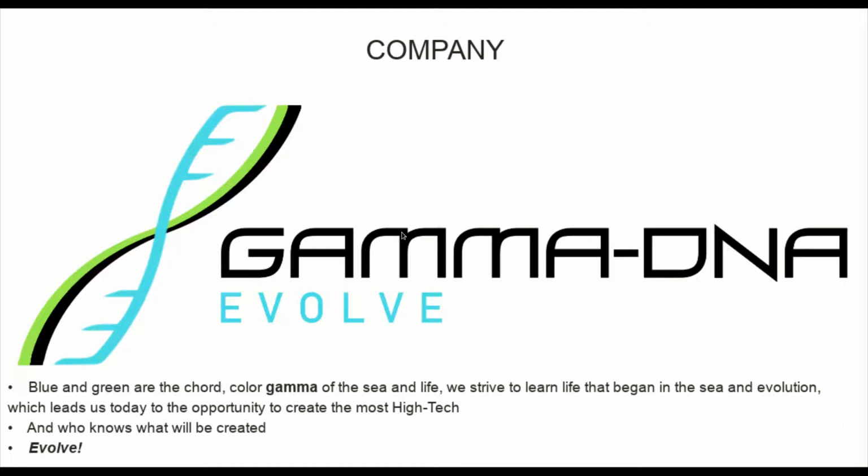I'll show you the program recovering the oligonucleotide sequence. The program is designed to recover the nucleotide sequence of a DNA fragment on the basis of the attachment of free nucleotides during the polymerization reaction of the DNA fragment, using time delays data.